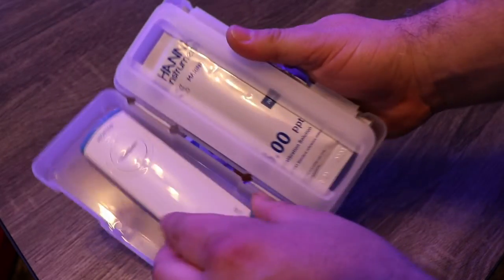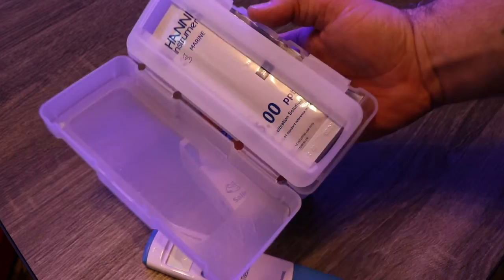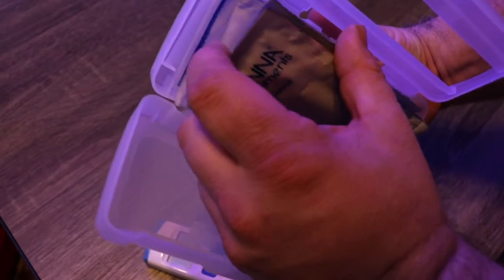It comes with a very nice case, and one great thing about this tester is that it also comes with the calibration fluid — you have quite a few packets in there, which is very helpful.